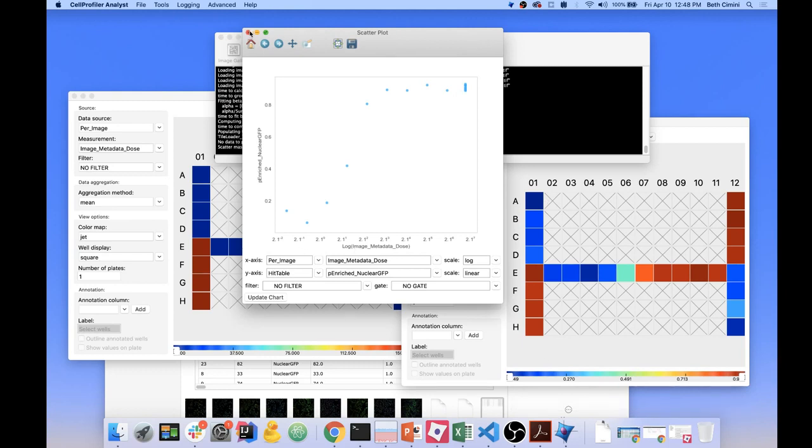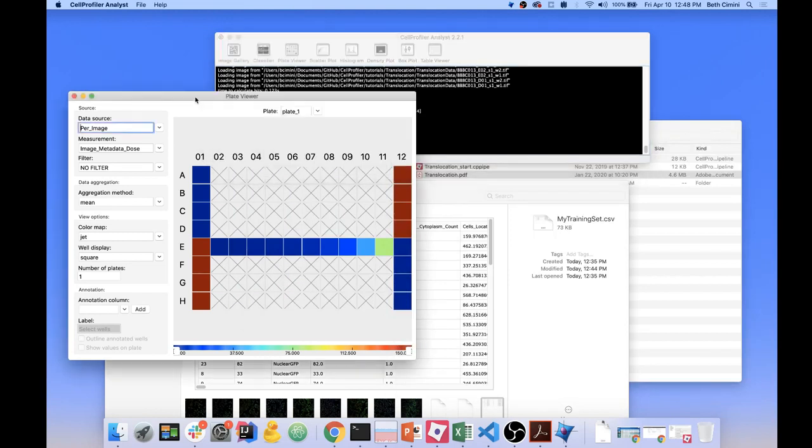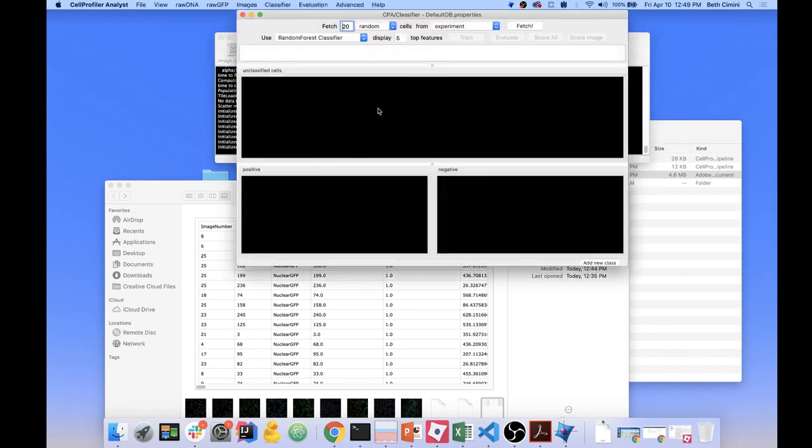There's a lot of other things you can do with CellProfiler-Analyst. You're not limited to just looking at individual cells. You can look at organelles inside your cells. You can look at C. elegans worms, for example. You can even actually use this for whole images. When we do quality control for screens in images in CellProfiler, we actually use CellProfiler-Analyst to create a classifier just like this to sort positive high-quality images from negative low-quality images.